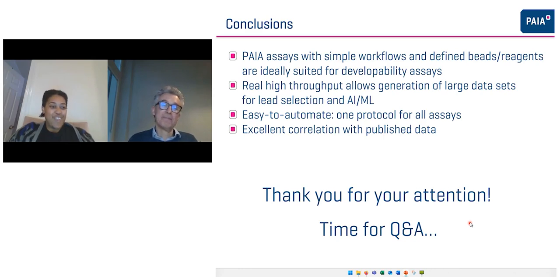Wonderful. Okay, we have a couple more questions in the chat. Why, in the case of the His tag protein, do you use the term polyreactivity and not polyspecificity?